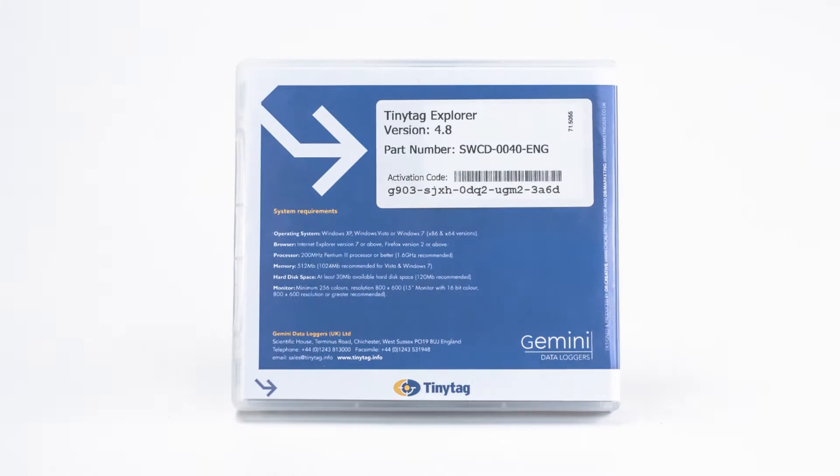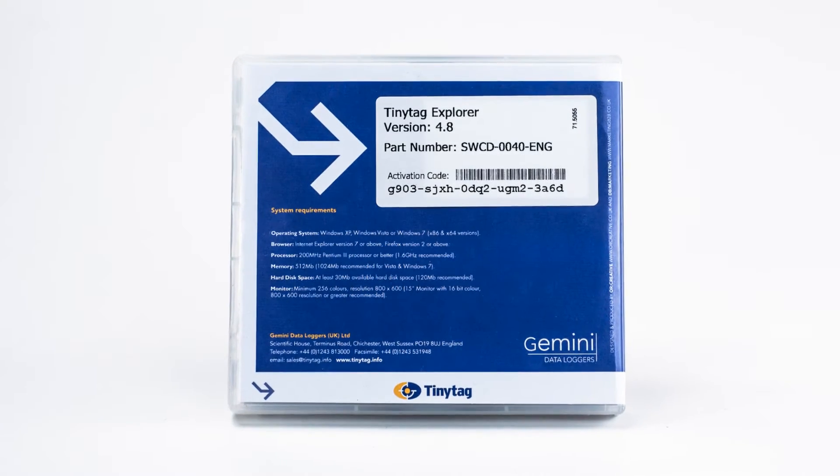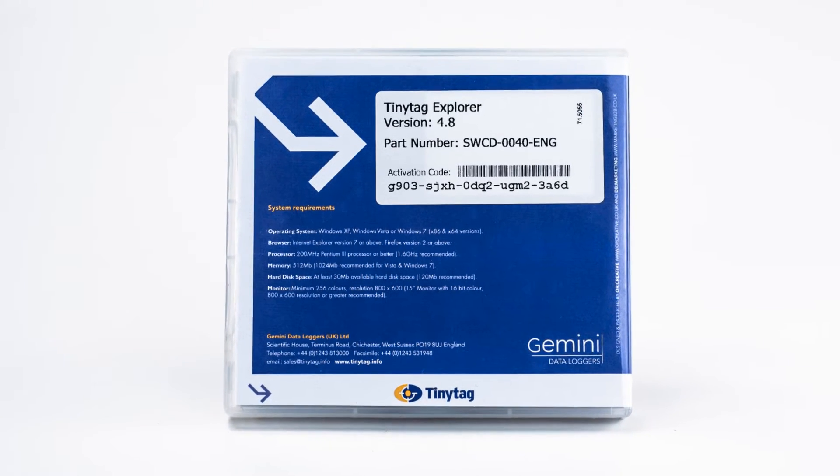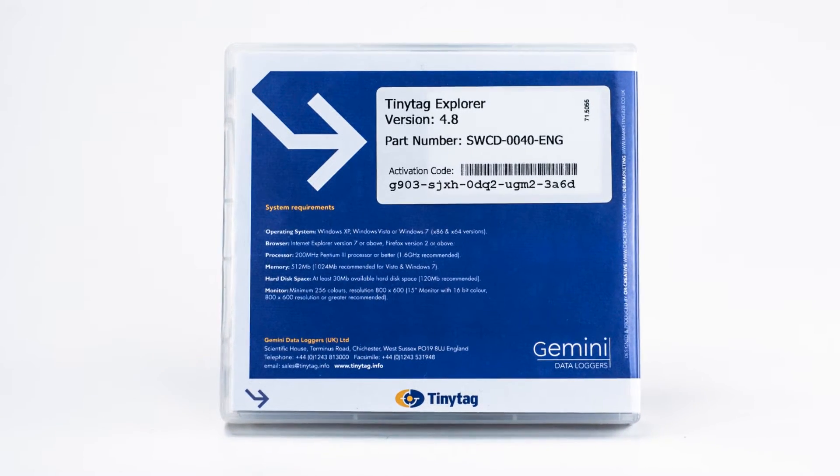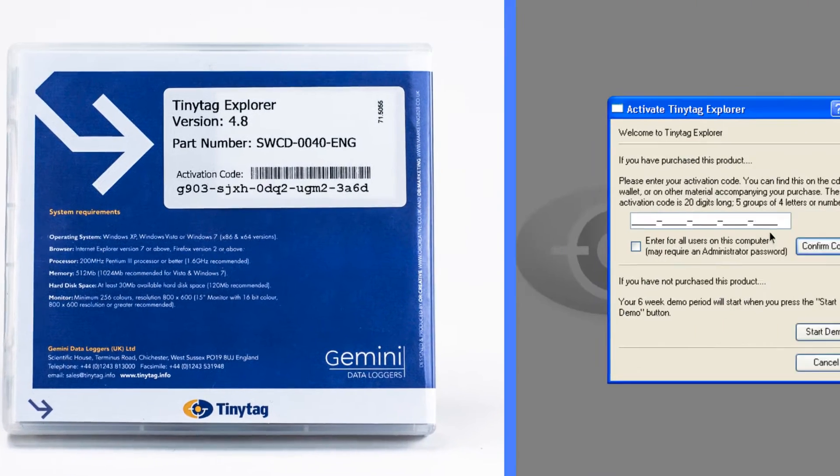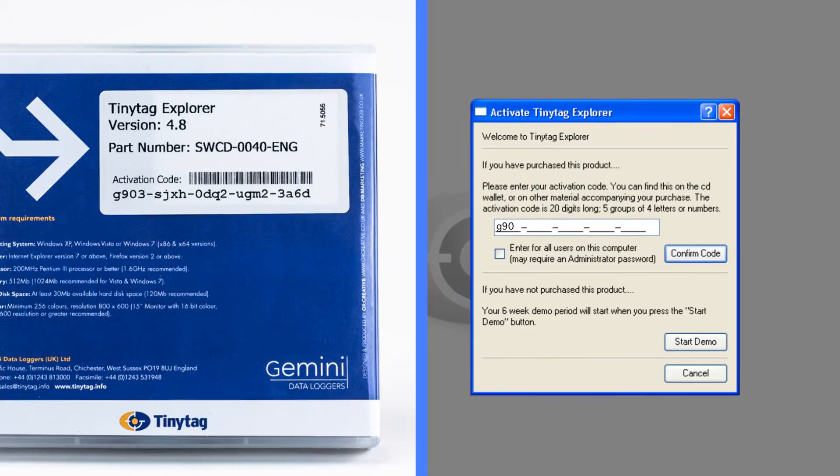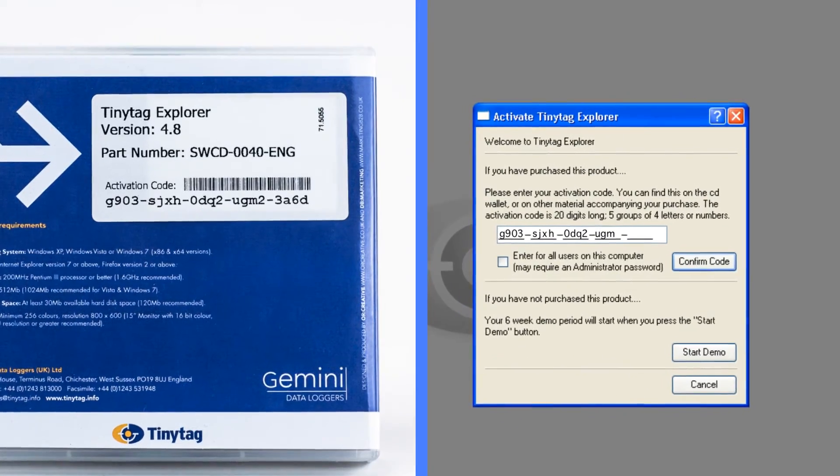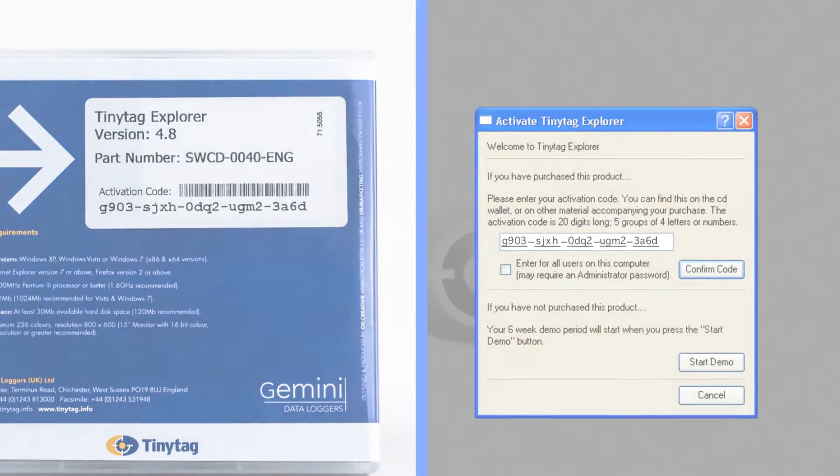Once the software is installed, the first time you run it you will be asked to enter an activation code. This can be found on the back of the CD case.